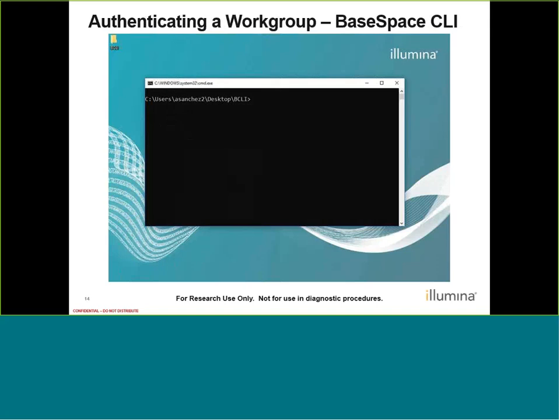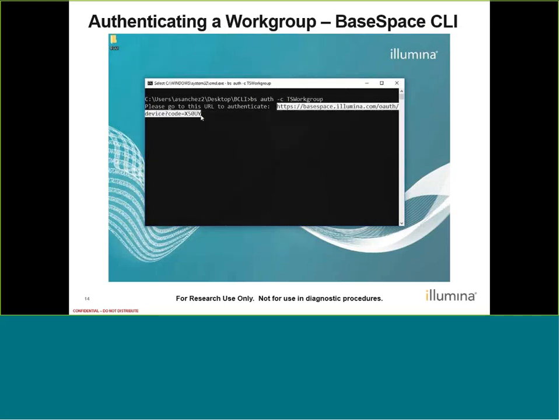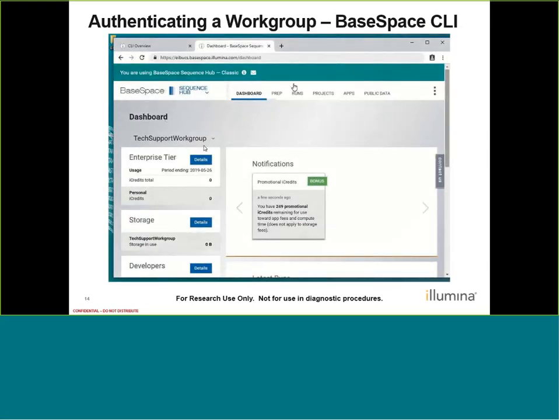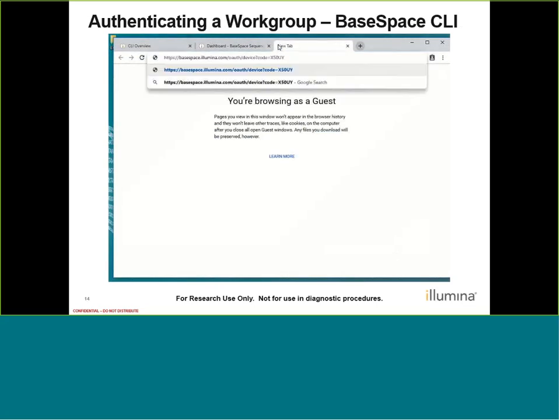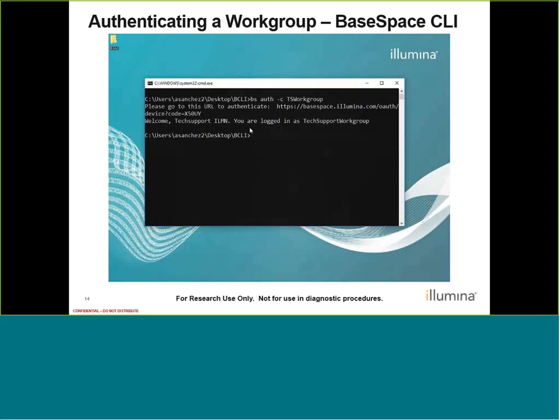Now let's talk about authenticating our workgroup. I'm going to type BS auth -C and name my workgroup config file 'TS_workgroup' for tech support workgroup, and hit enter. Like before, a URL is returned and I copy and go to my BaseSpace account — I see that I'm no longer in personal, I'm in this workgroup. So I paste my URL and accept. Now the difference is that it recognizes tech support but it also says that you are logged in as tech support workgroup, meaning I'm logged in as the workgroup that I was configuring.